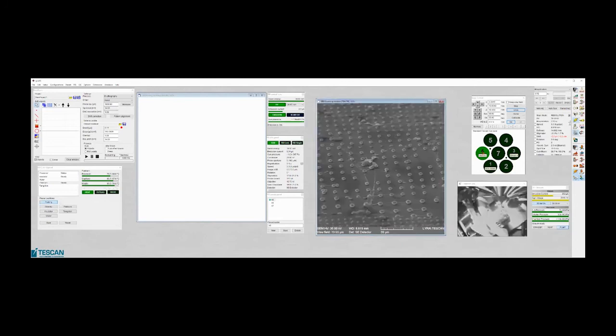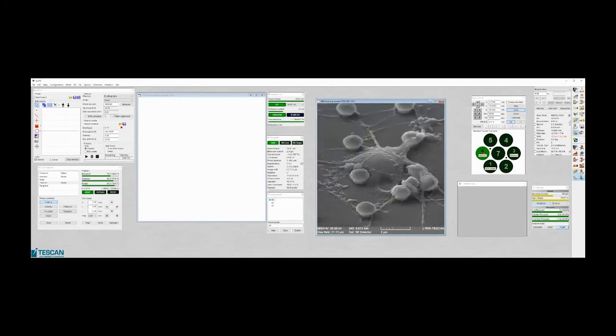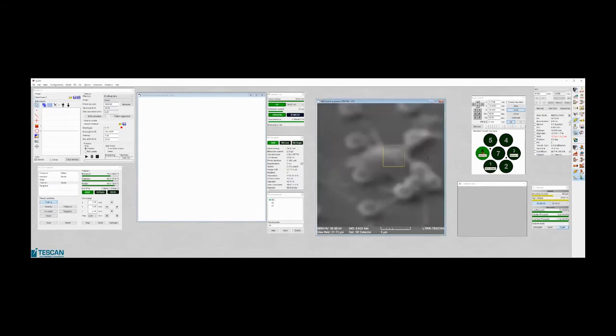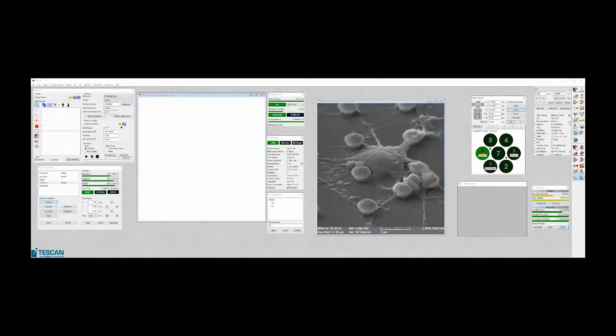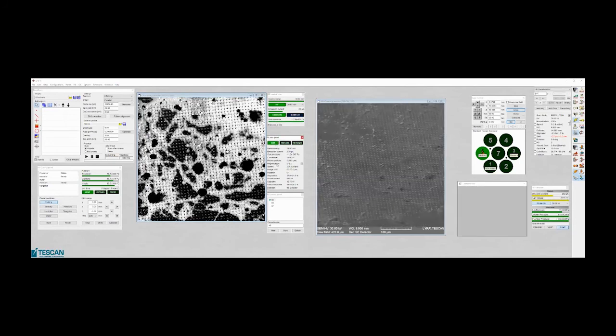I don't know which one. Okay, this one, for example. So we will focus it. Again, we have to find the same position.